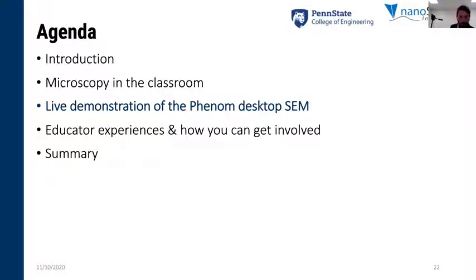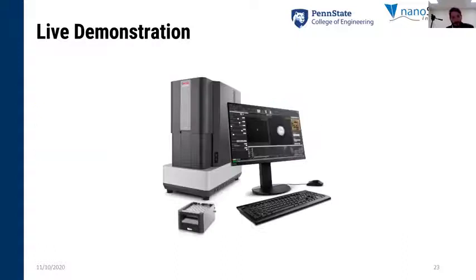So at this point, I'm going to show you in real time what this microscope looks like and how I can use it. I'm going to control it from the same laptop I'm projecting this PowerPoint from. And then after that, we're going to turn it over to Bob and Ozgur for a questions break. And then we're going to go to our panelists, and they're going to talk very practically about what they're doing with remote education.